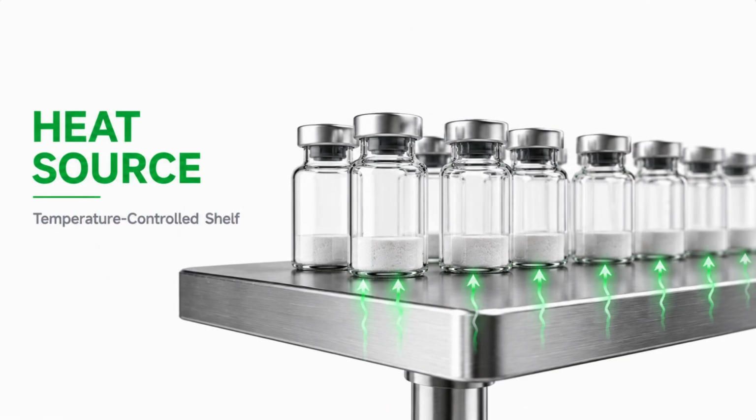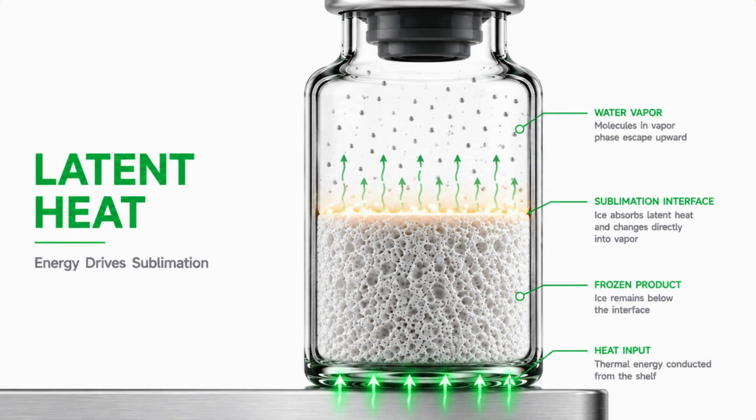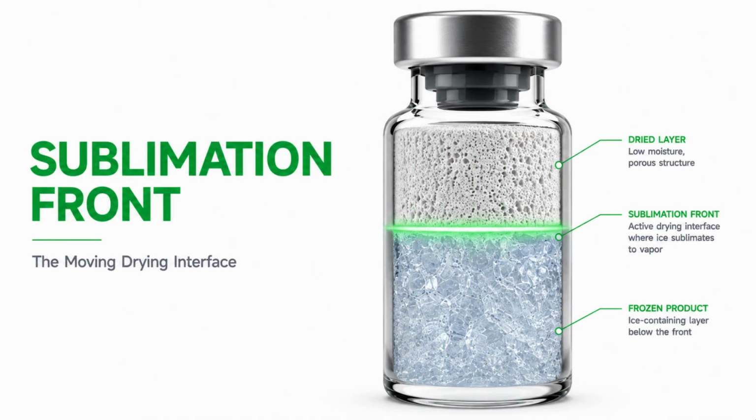Primary drying begins with a controlled source of heat. The temperature-controlled shelf transfers energy through the glass vial and into the frozen product. As this energy reaches the sublimation front, it provides the latent heat required for ice molecules to break free from the crystal lattice and enter the vapor phase. The energy pathway is continuous, from the shelf, through the vial, into the product, and finally to the sublimation front, where sublimation takes place.